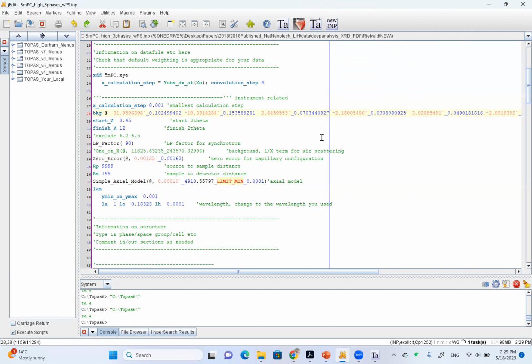But you cannot put it in a too simple way. Let's say, okay, I just put in 2. Obviously, it doesn't work, right? You can never approximate a function with just a line or even a quadratic. It doesn't work. So my experience is you may want to start with something like 4 or 5 parameters, which is about a 5th order polynomial for background. So they have enough flexibility, but not too much that would influence the peaks.